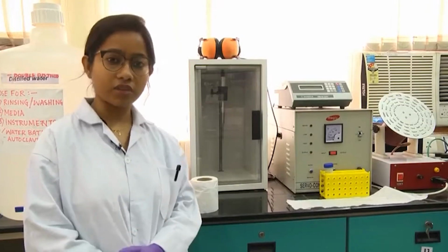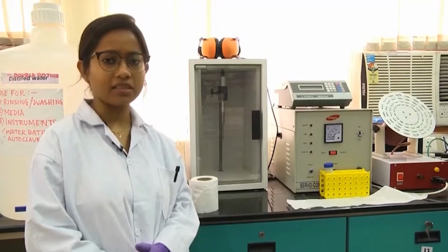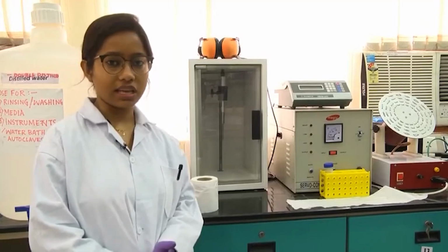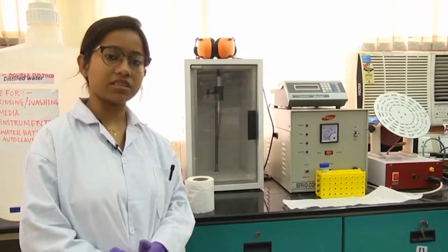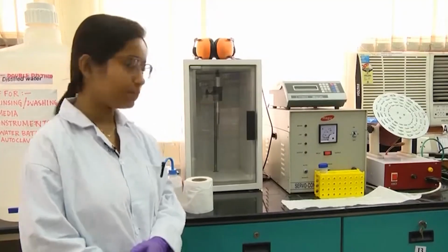After that we will go for a centrifugation, so there will be separation of the insoluble fragments and the solution. If your protein is in the solution, then you can easily isolate the protein from the solution, or if it is in the insoluble fraction, then the steps are different.